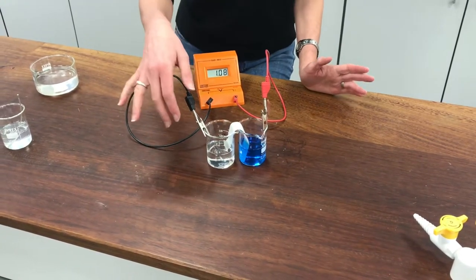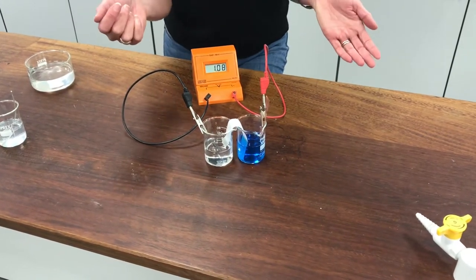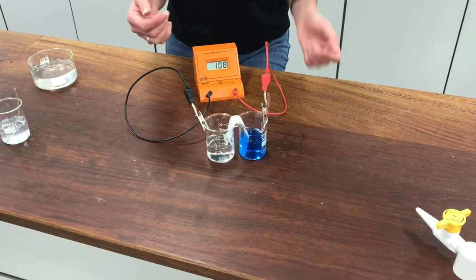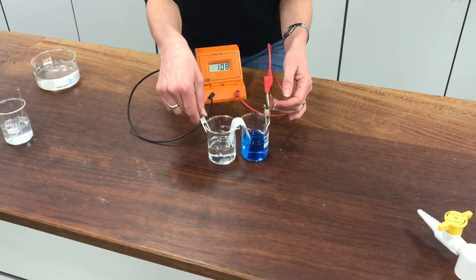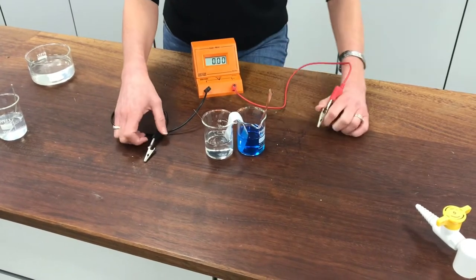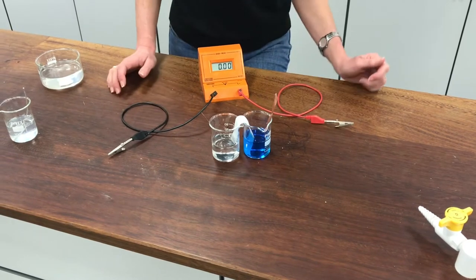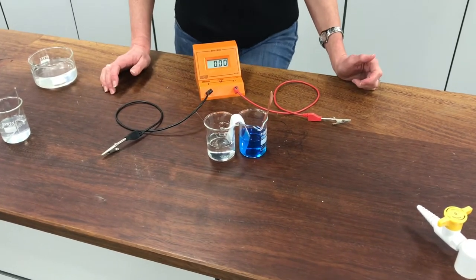Now this has been very interesting mucking about with these, and obviously I could play about with lots of other different metals and see what different potential differences I could measure. But one of the things that we want to do as chemists is sometimes not to have to do the experiments all the time and be able to use other people's data to save us a lot of work—so I think fundamentally we're quite lazy.